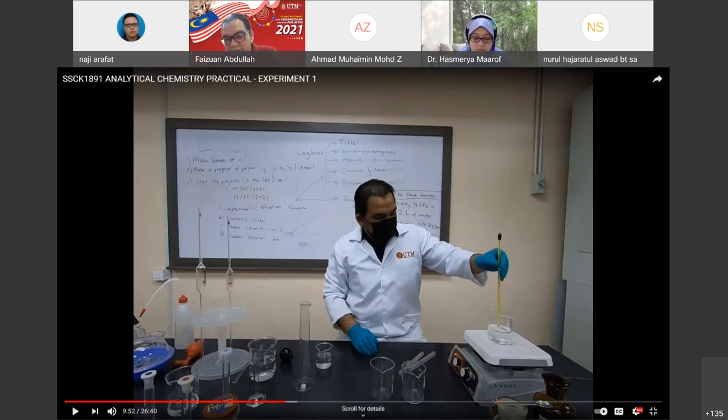You mean the mercury will come out from the thermometer? It will be broken, right? The thermometer will be broken, right? Okay. Actually, the mercury will react. That is the first one. But the second one. The first one, yes, the thermometer breaks. Then the dangerous mercury will come out.